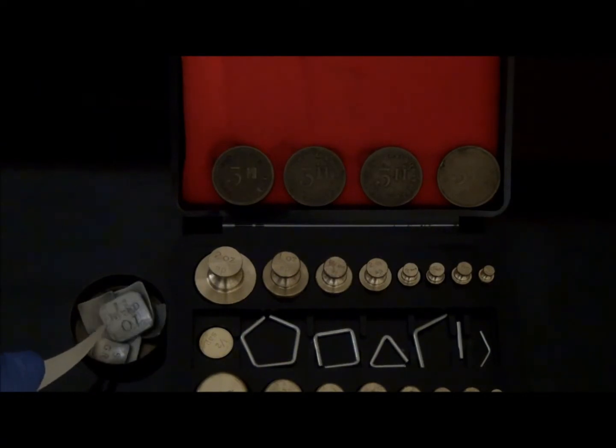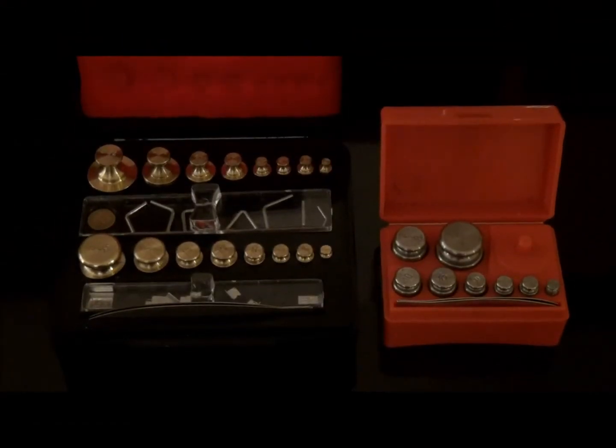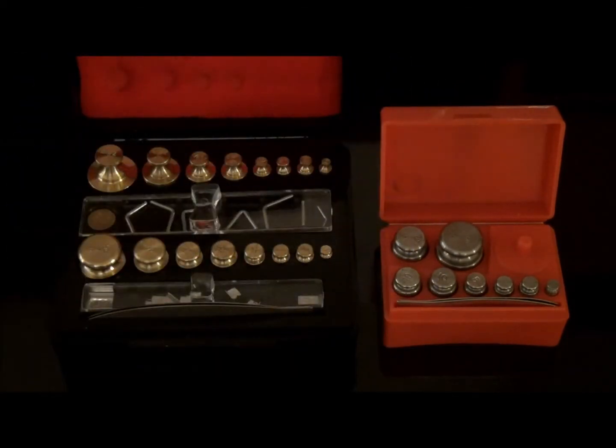We will now go over instructions for proper handling of weights. When handling weights, it is important to always use forceps. Never handle weights with your bare hands or dirty gloves to prevent the accumulation of body oils, chemicals, and debris which may compromise the true measurement.